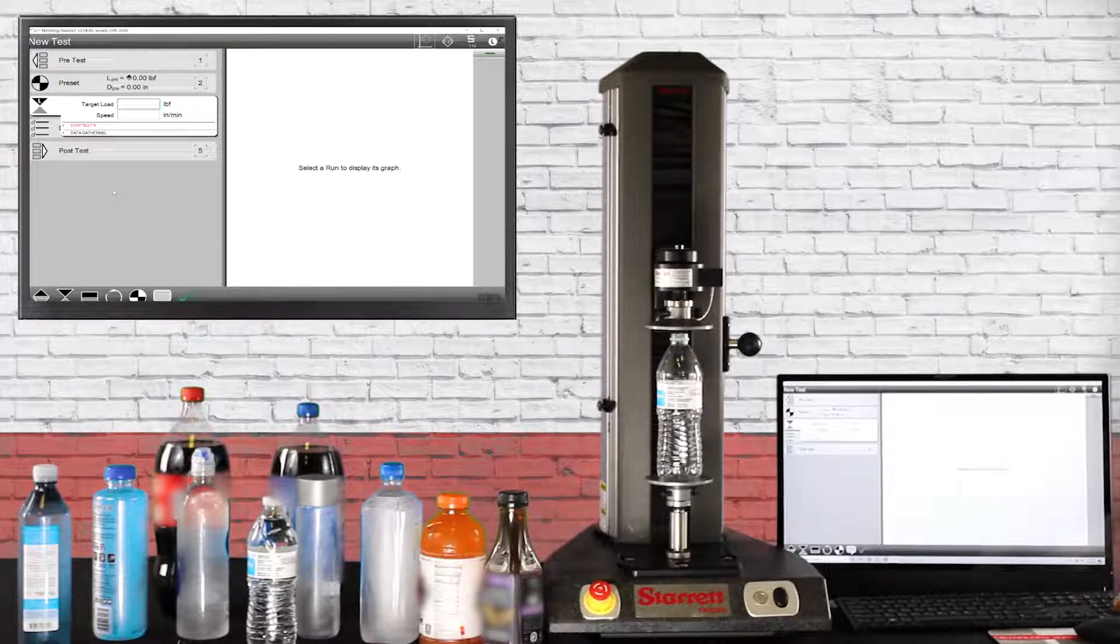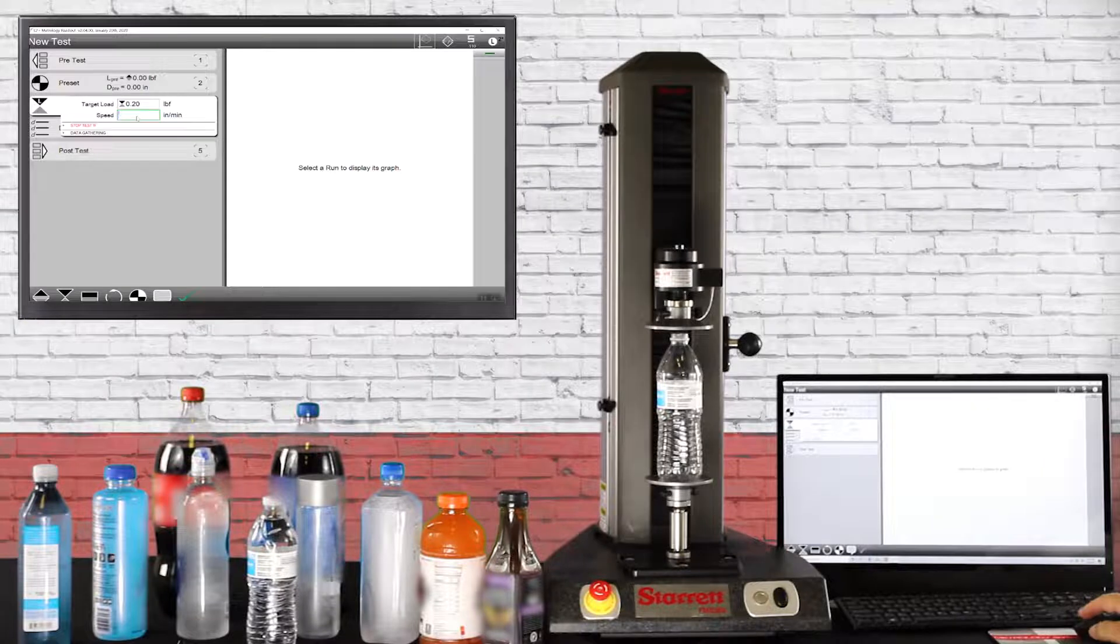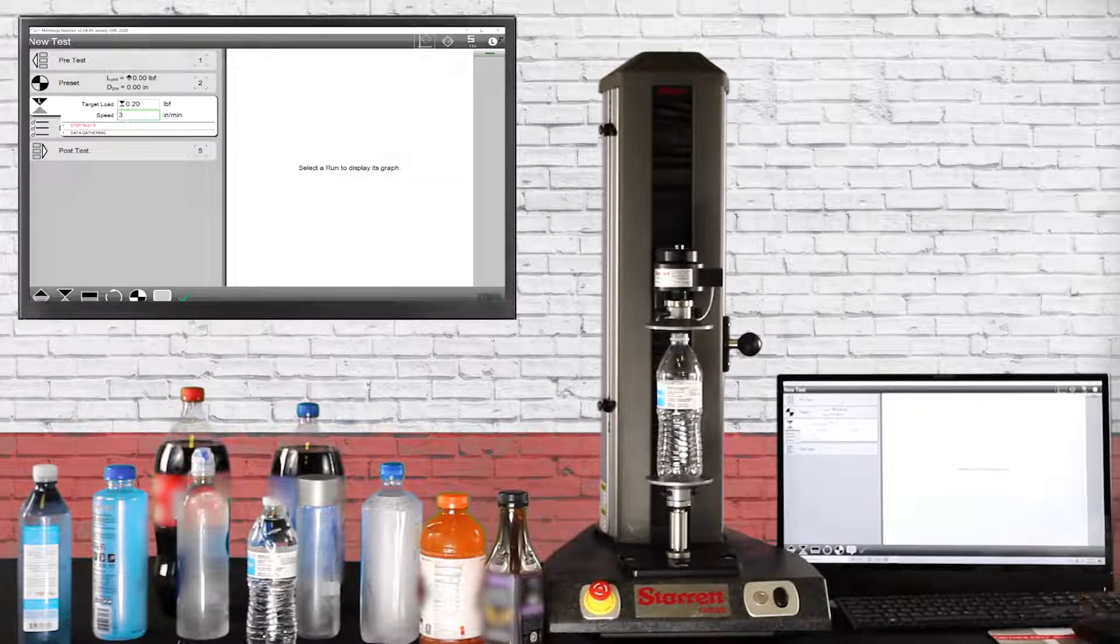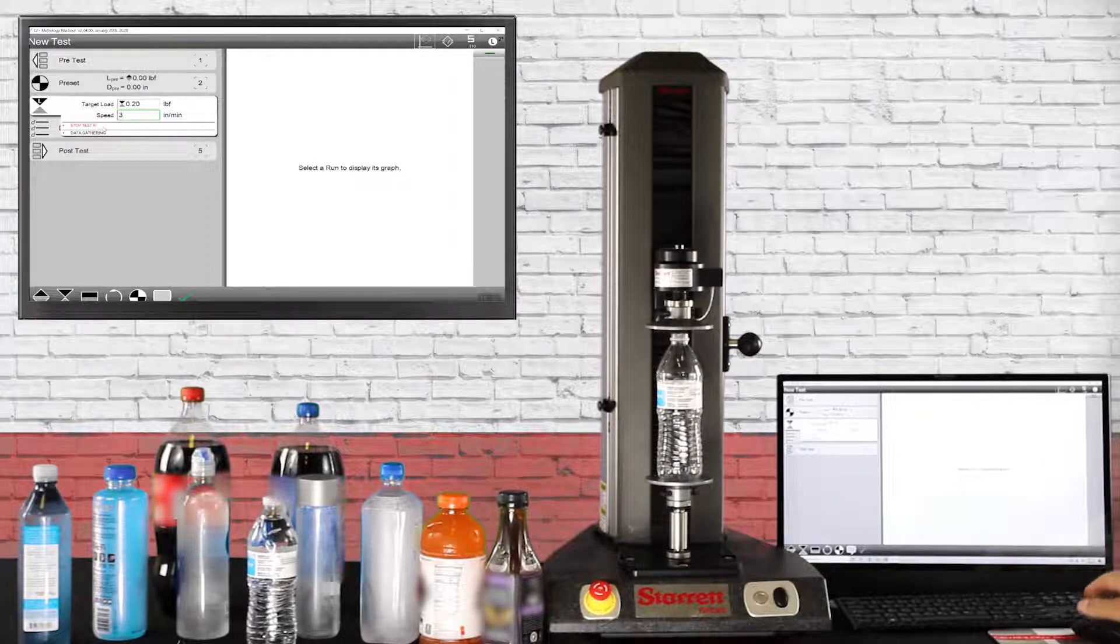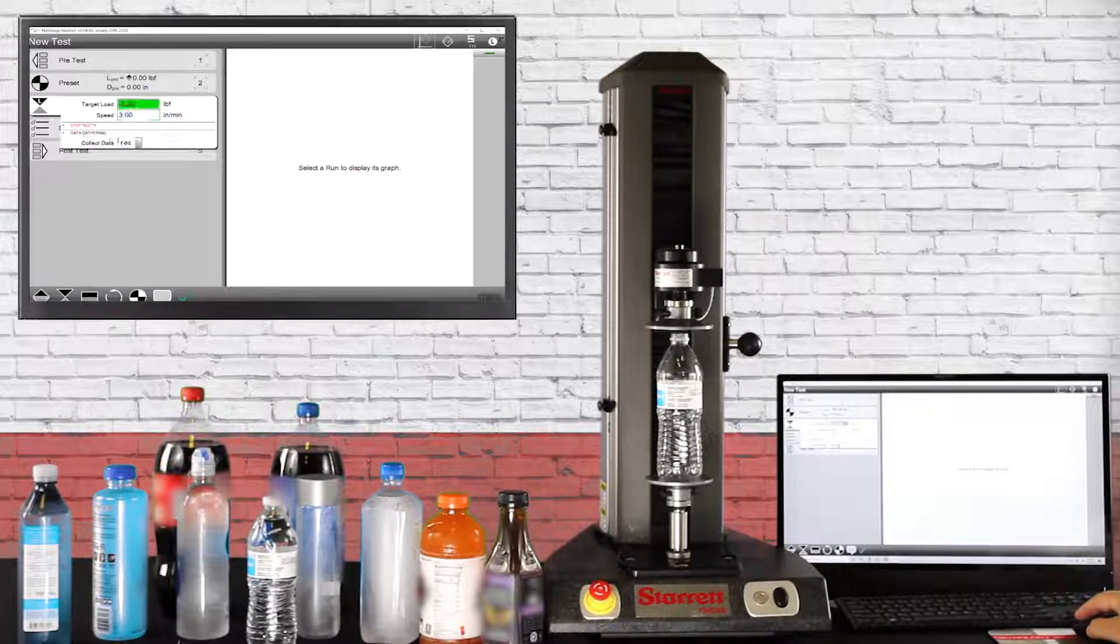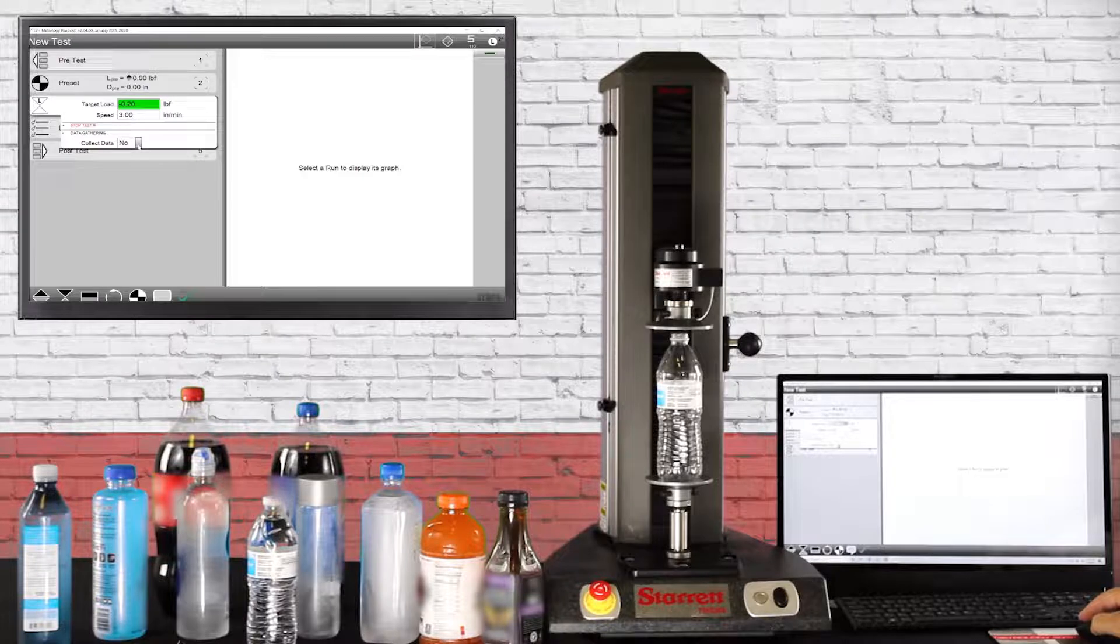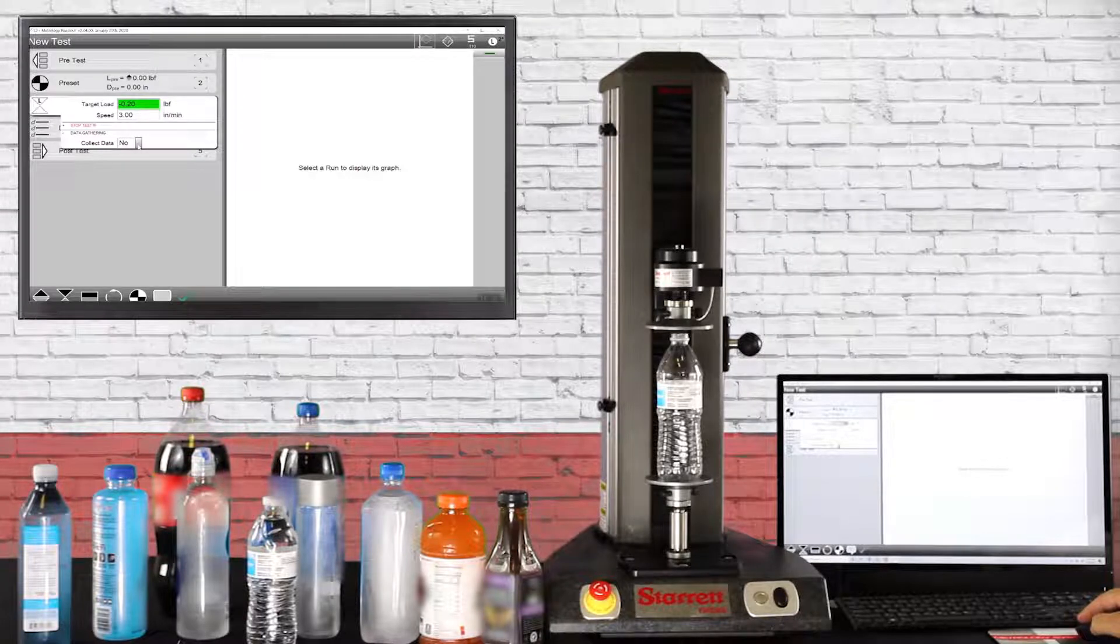Next we're going to go to a load, a very light load of 0.2 of a pound at three inches a minute. Down here where it says data gathering we're going to say no data gathering. All this is going to do is allow us to move down and touch off of the top of the bottle.